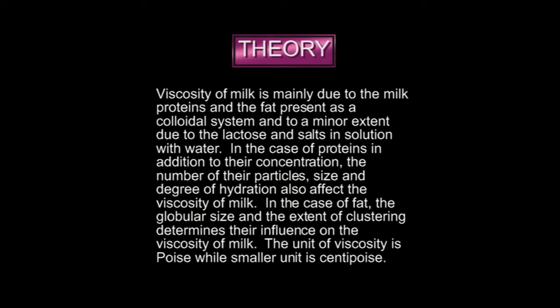In the case of fat, the globular size and the extent of clustering determine their influence on the viscosity of milk. The unit of viscosity is poise, while the smaller unit is centipoise.